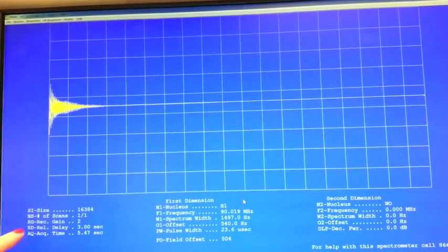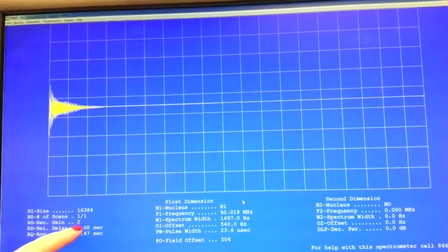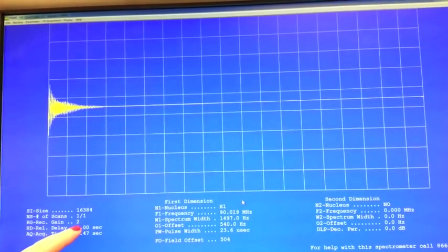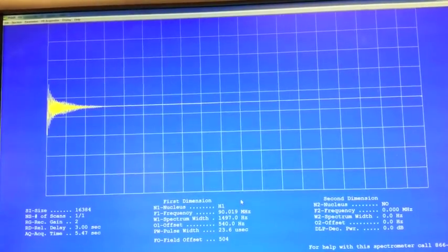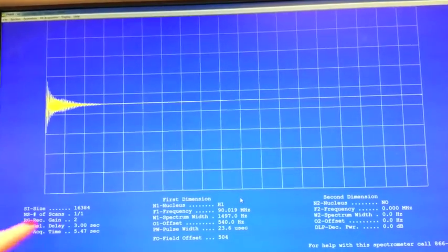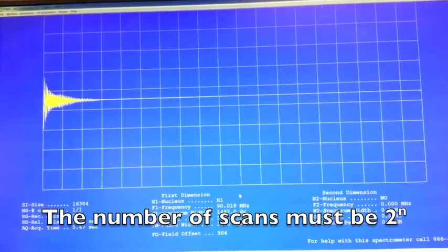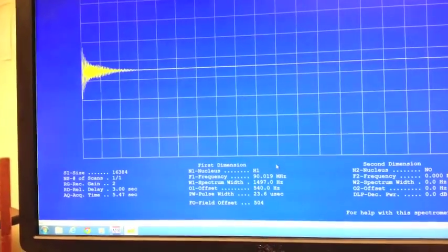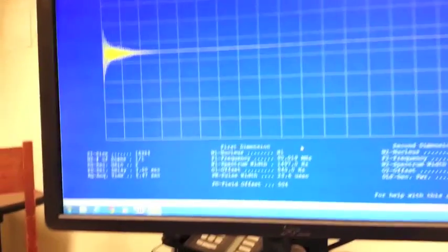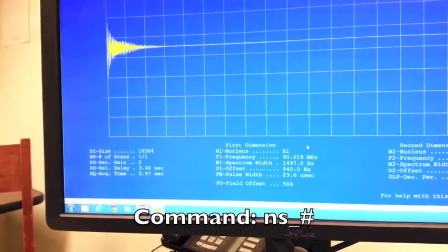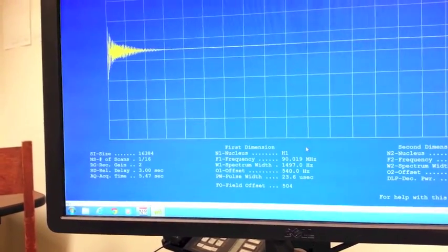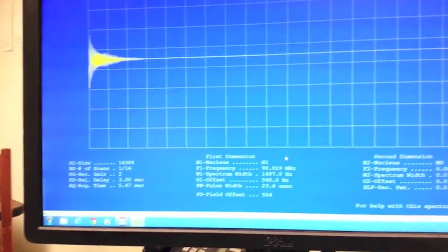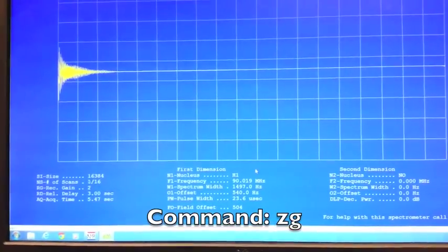Sometimes it takes a few tries to find the right receiver gain. As you can see, it took me a couple tries, but I found out that the right receiver gain is 2. Once you've found the right receiver gain, you want to go ahead and change the number of scans to the correct number you want. In my case, I'm going to try 16 scans because that usually works pretty well. And take my scan one more time.